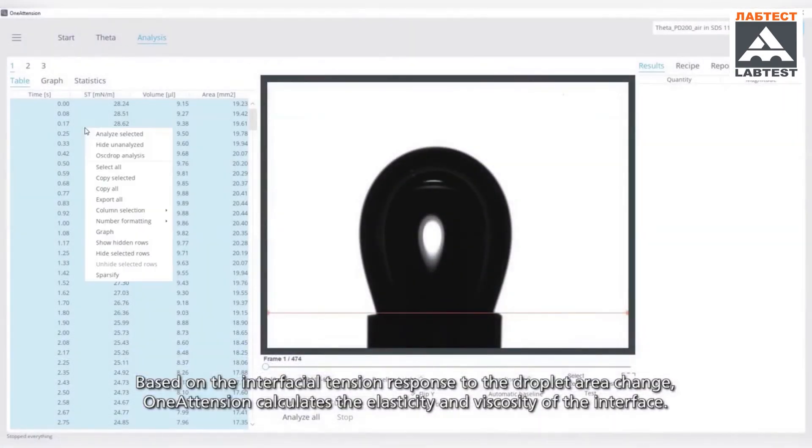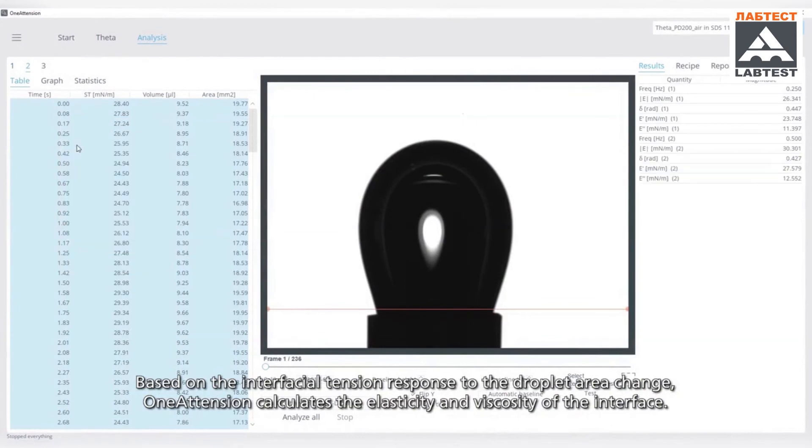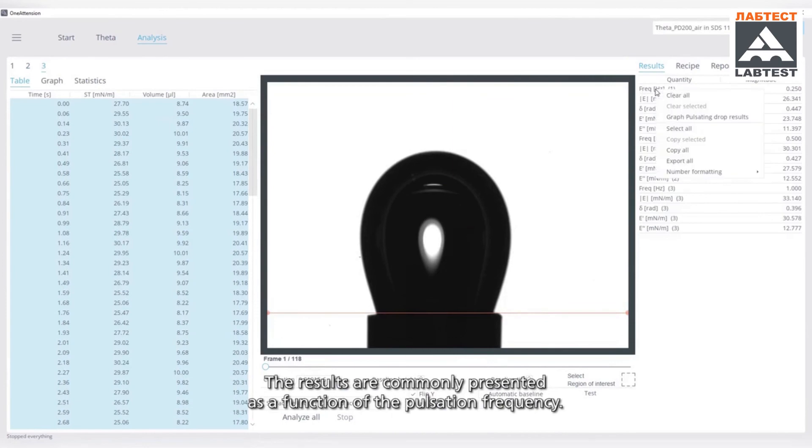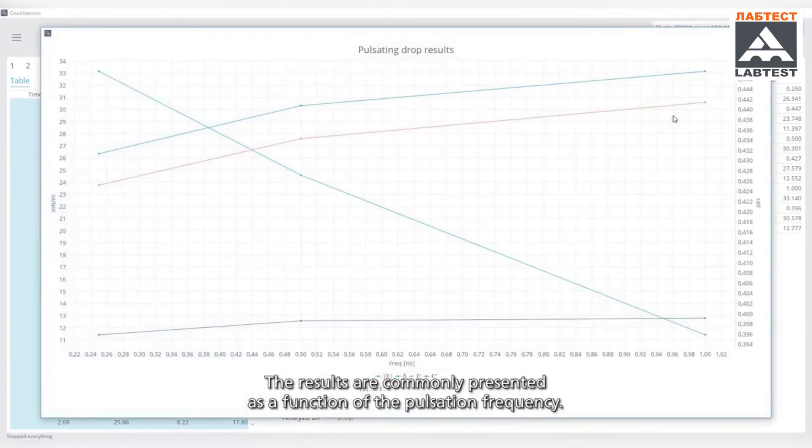Based on the interfacial tension response to the droplet area change, OneAttension calculates the elasticity and viscosity of the interface. The results are commonly presented as a function of pulsation frequency.